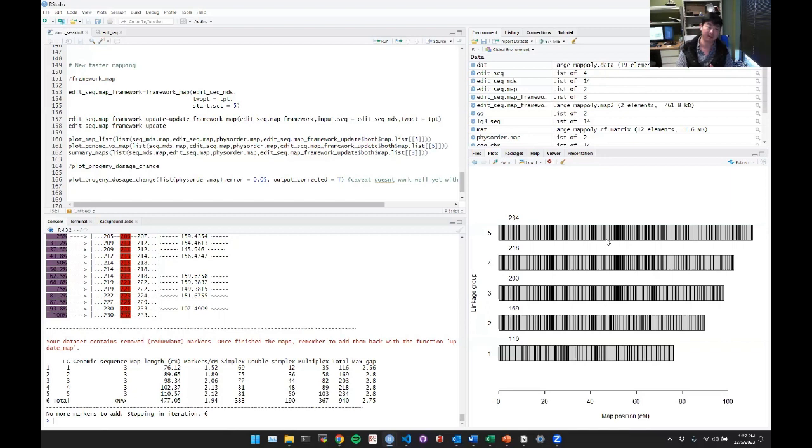Beforehand, using earlier versions of MapPoly, it probably would be very difficult to test, but now with Framework Map and updating Framework Map, you should be able to do this kind of test and see how efficient it is, or whether it's even feasible, or if it's worth the trouble to do the alignments twice, merge the VCFs, and then do all of that together. We haven't done it ourselves, but it would be interesting to hear from you if you end up trying.